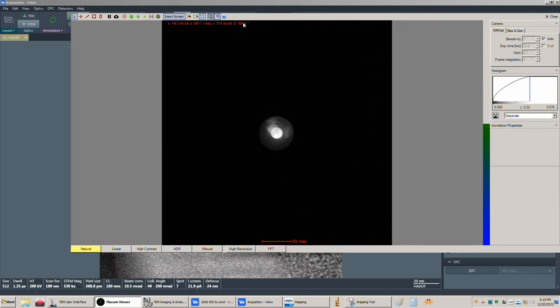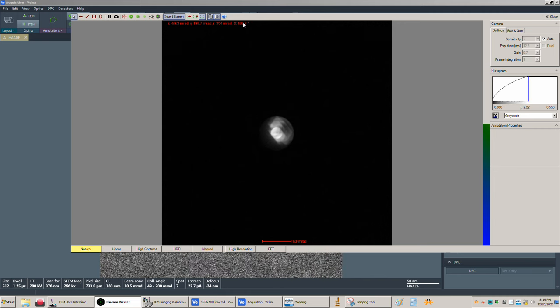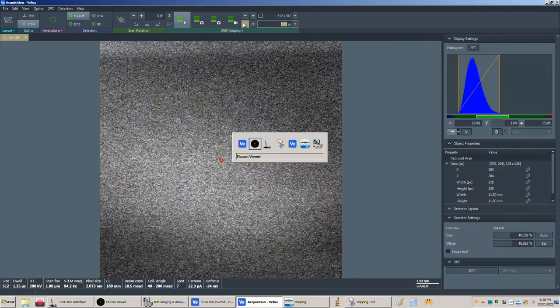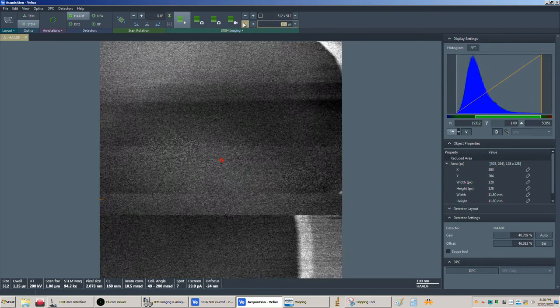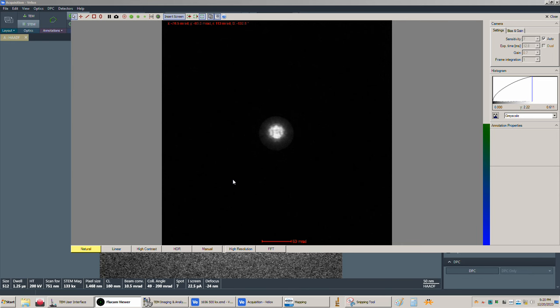Well, do we want to try and get some zone axis here? Let's see here. Yeah, we've already done it. Why not? Let's try. All right, so that's a beta minus adjustment. Okay, so yeah, right in that area. I can see pretty clearly now. I'm moving the stage around till I get to a spot that looks right about there. All right, so now I'm going to adjust Z.